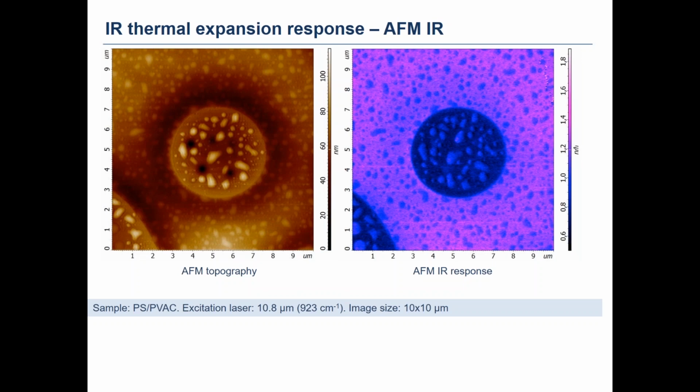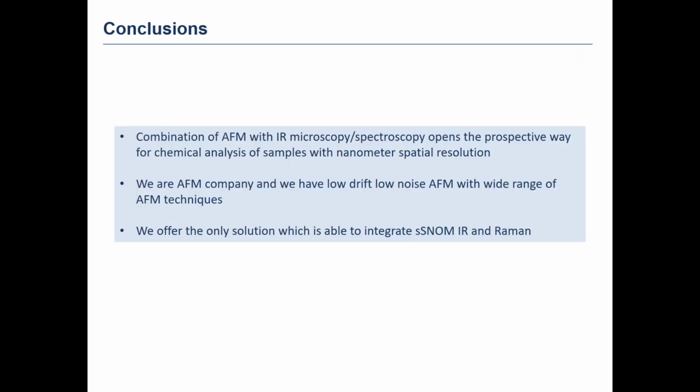So we are now going to conclusions. First of all, it's definitely the combination of atomic force microscopy with infrared microscopy or spectroscopy opens a wide perspective way for chemical analysis of different types of samples with nanometer spatial resolution.